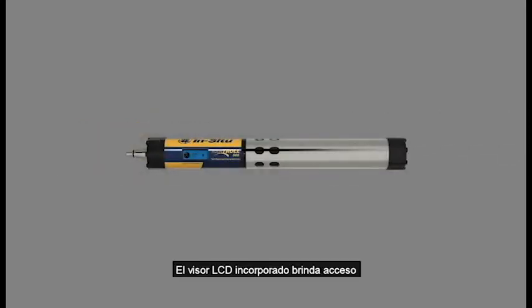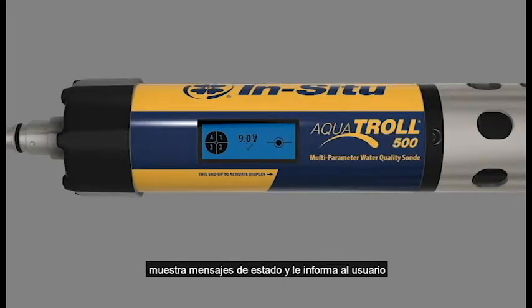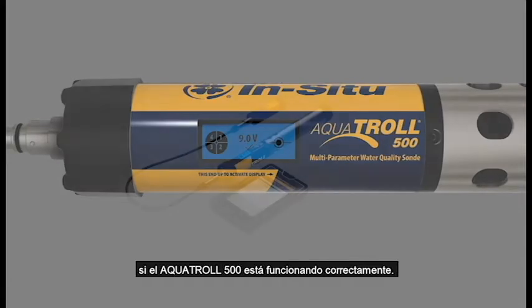The built-in LCD screen provides access to many of the instrument's features, displays status messages, and lets you know your Aquatrol 500 is working properly.